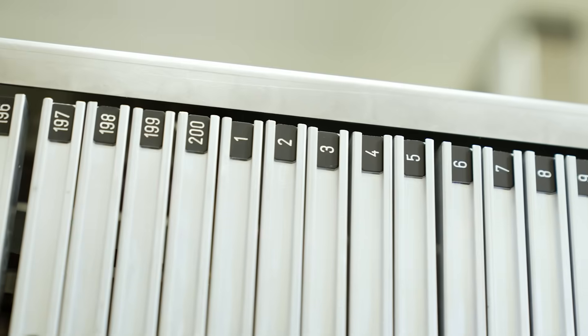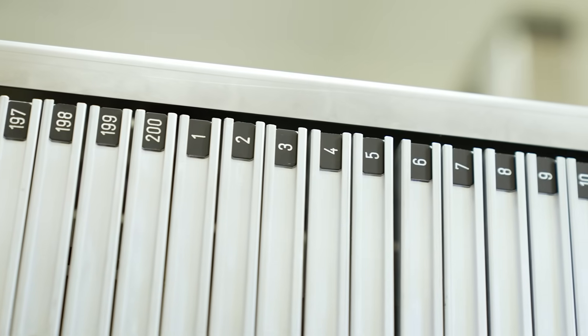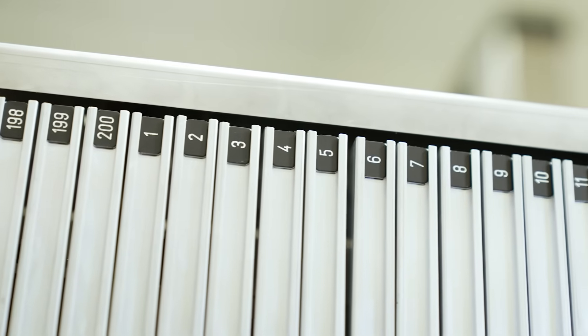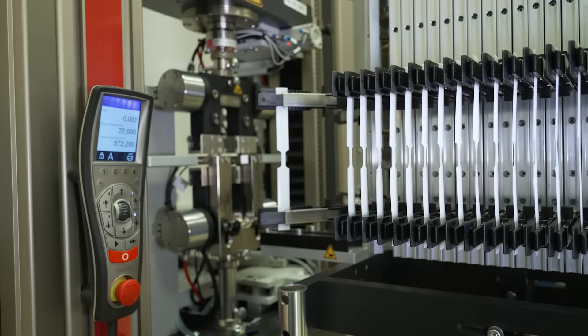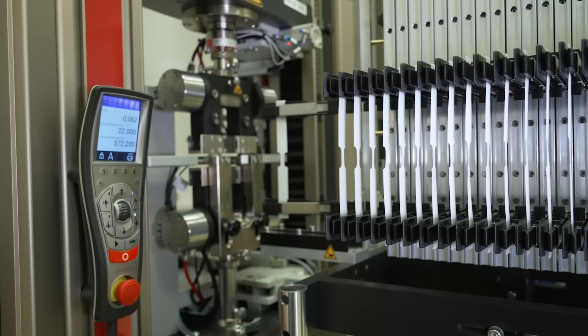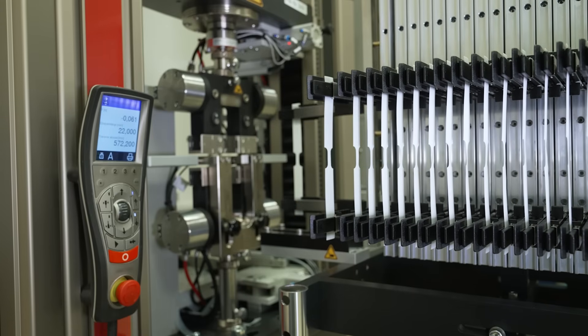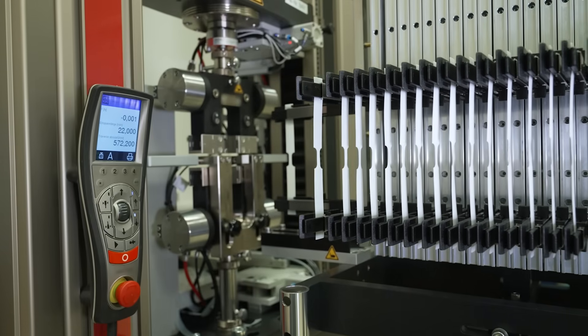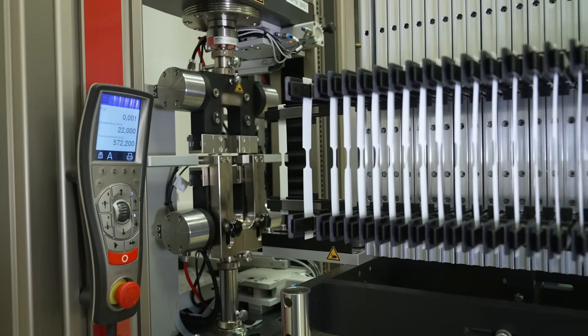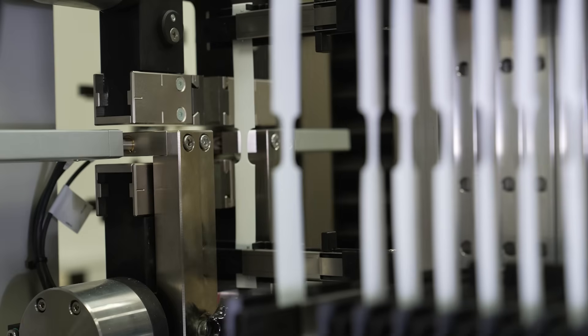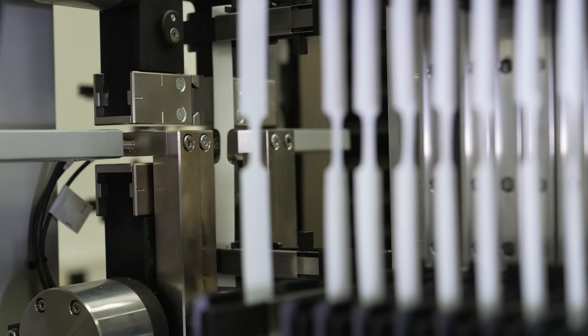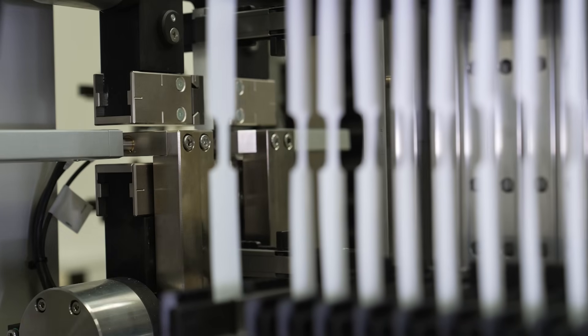We are able to put here 200 samples at once in the magazine, and these samples are directly carried into the machine and tested one after the other.